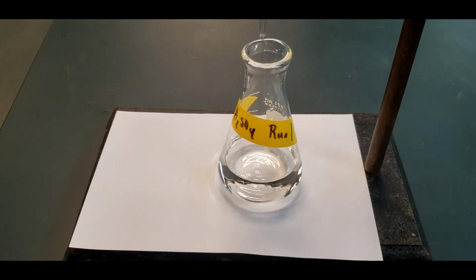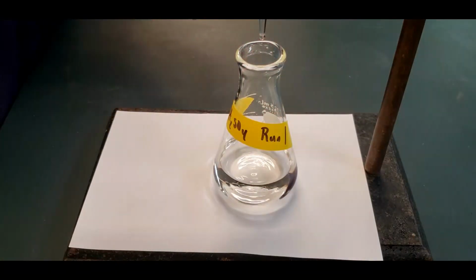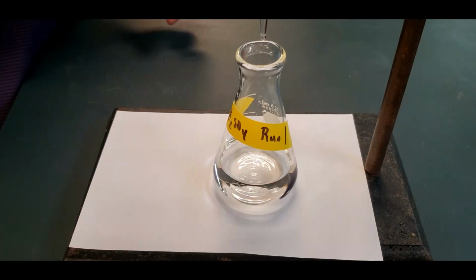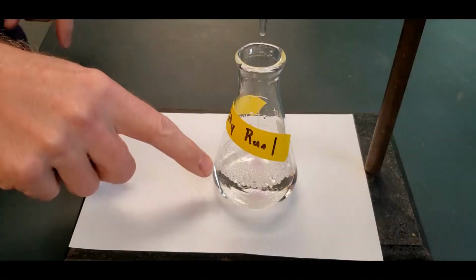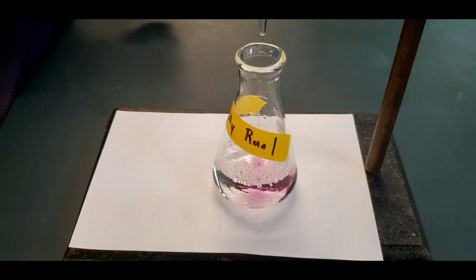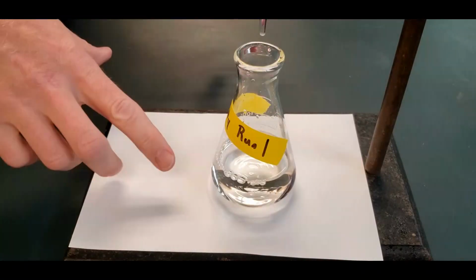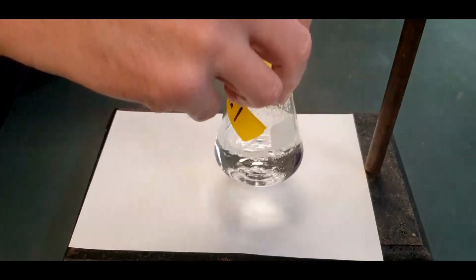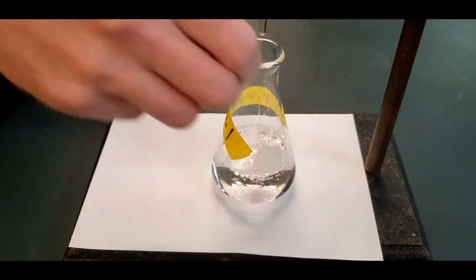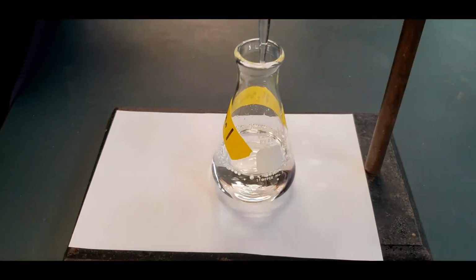And so let's try this out. So this is the first one. When you're doing this, make sure you're at 0. So you start it out. First thing you should see when you start is that pink color. That indicates that you have the indicator. If it looked like nothing had happened, that's probably what you did wrong, that you didn't put the indicator in. Now I'm going to, hold on just a second, I got the burette a little high. There we go. Don't want it spilling out.